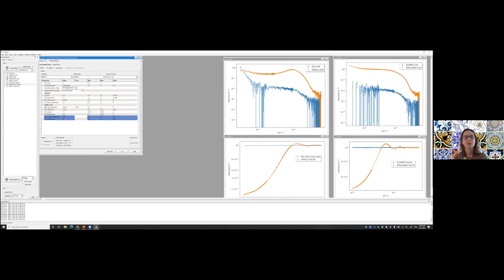If you've never done a simulation, you can probably still do it just following the instructions. And again, you can drop us a message, or the SASSIE developers also welcome people contacting them and they help you with making it work if you need to, especially if it's a very complicated macromolecular assembly. But you would do that and then you'd calculate a curve and compare it with this one. So that's the ideal. In some ways, it's a blessing and a curse.